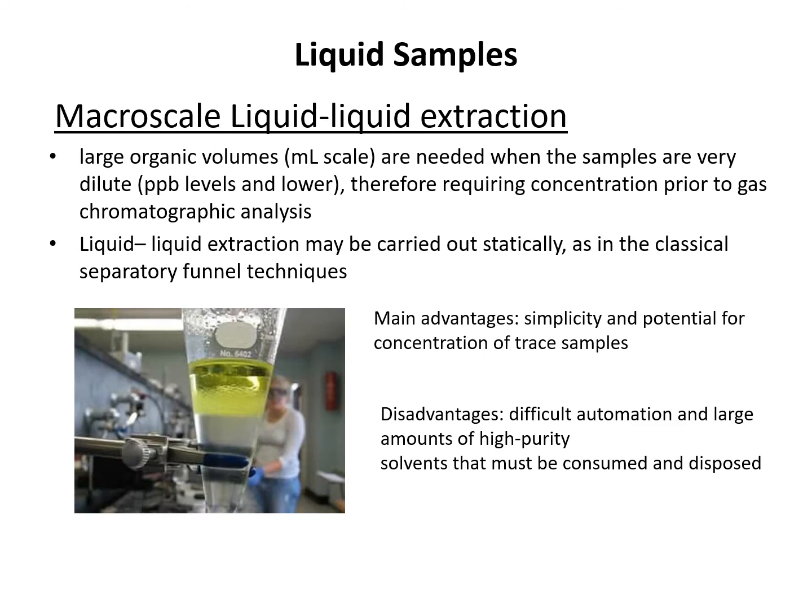So now let's move on to macro scale liquid extraction. The main advantages of this extraction are the simplicity and potential for concentration of trace samples.